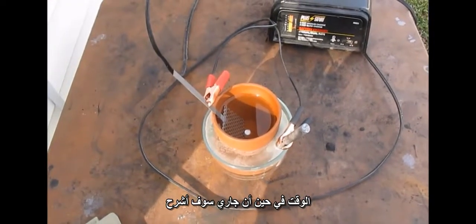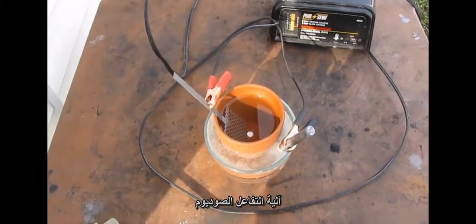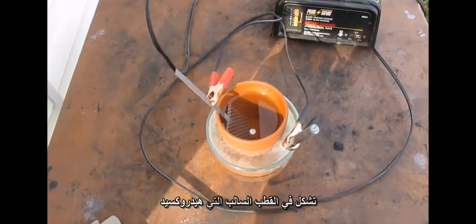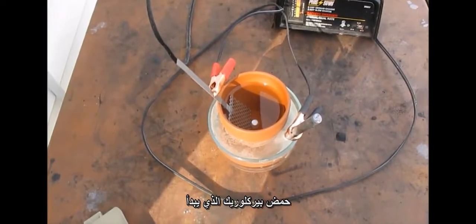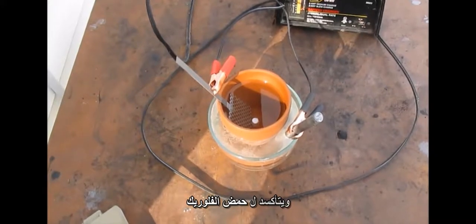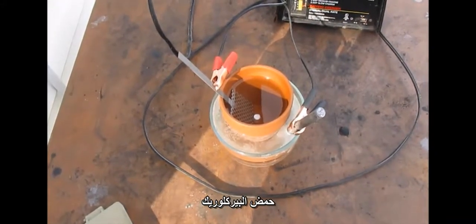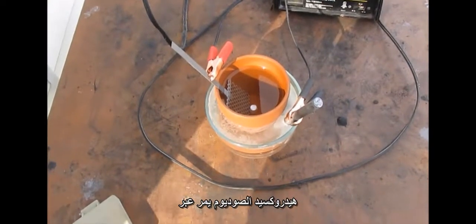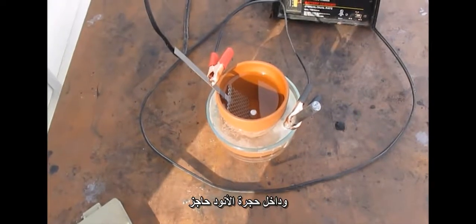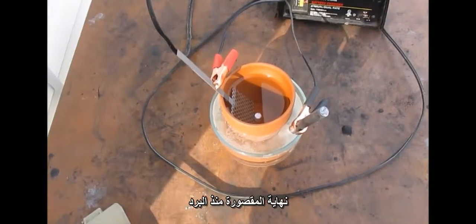While that's underway, I'll explain the reaction mechanism. The sodium hydroxide that forms in the cathode compartment is attracted to the perchloric acid, which starts off as chloric acid and gets oxidized to perchloric acid. The sodium hydroxide goes through the barrier and into the anode compartment, and sodium perchlorate is formed in the anode compartment.